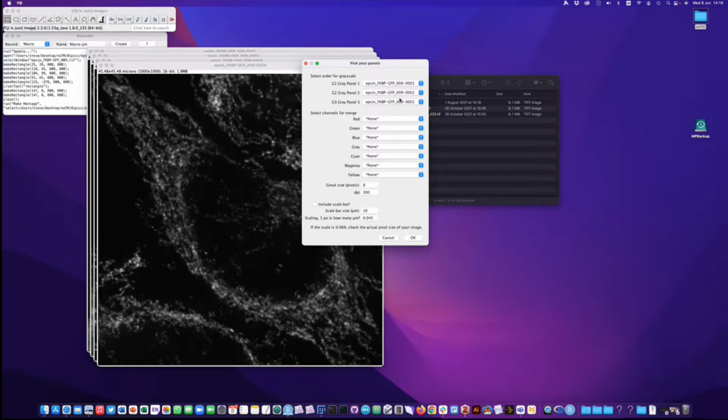And so typically what we do is put them in green, red, blue order and then have the merge on the right. So if you remember, channel 1 was the DNA, so we're not going to show that. What we'll do is put the green here, the red here, and the far red here. And then we can select how we do the merge. So let's put the green in here. So that's 2. This one's 3, and this one's 4.